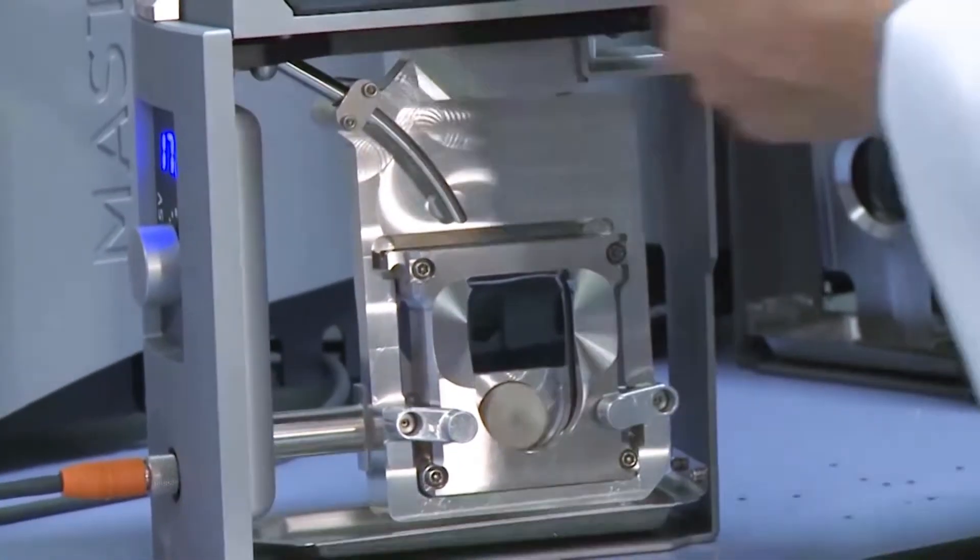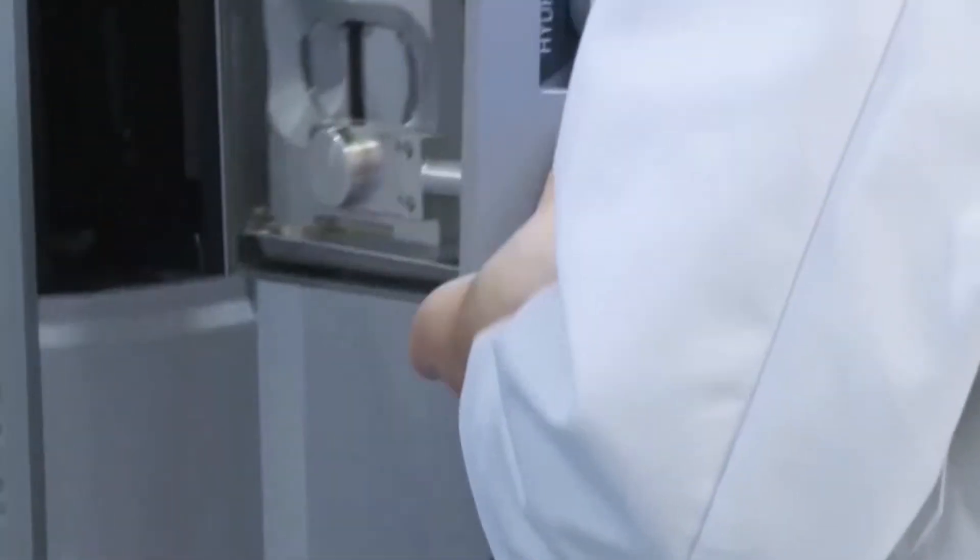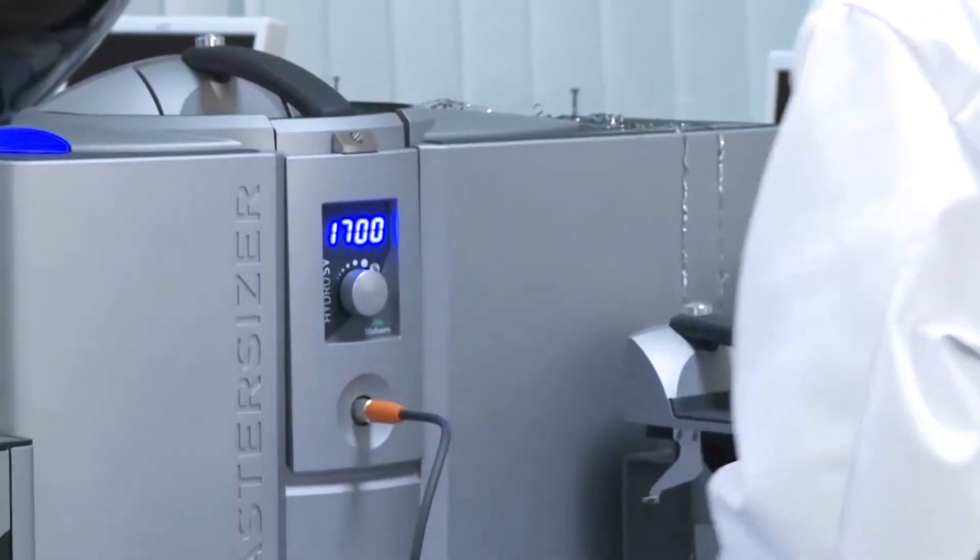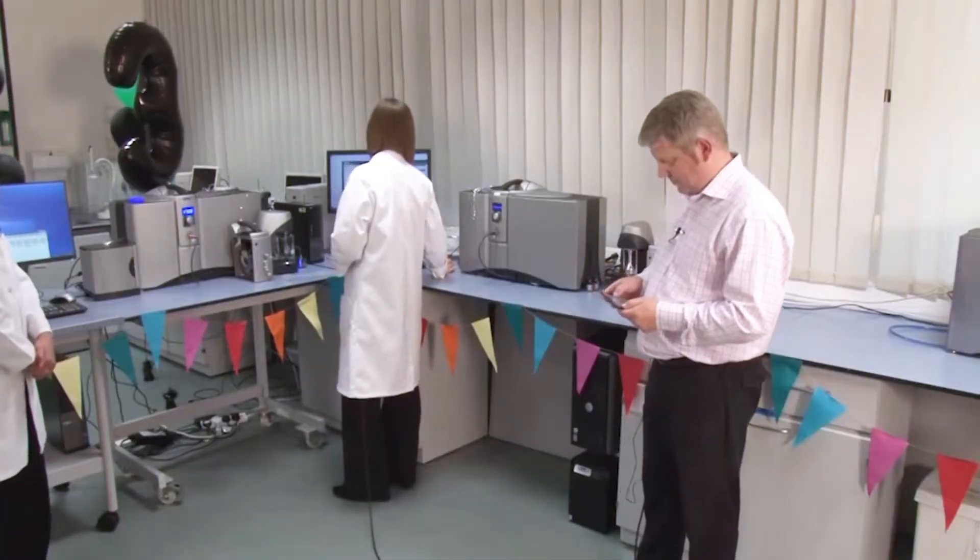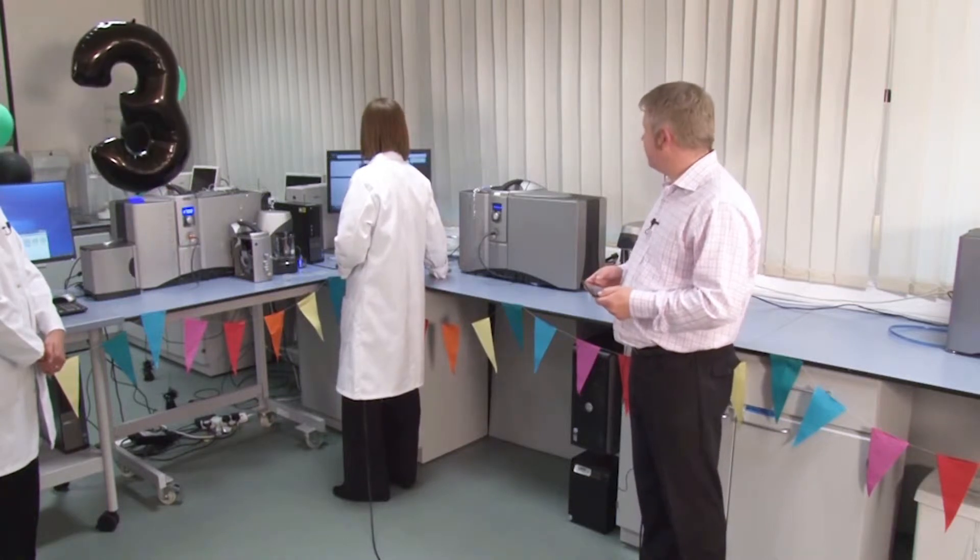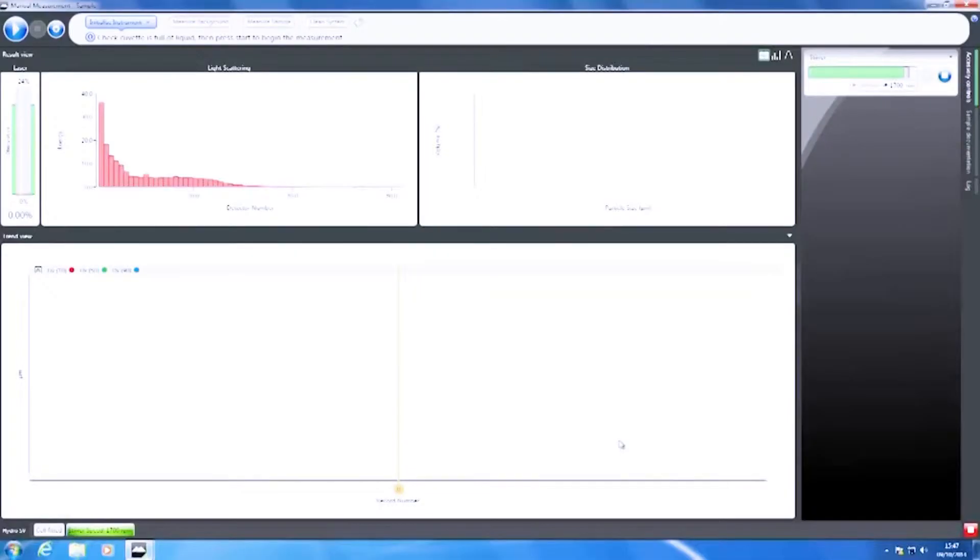There we go. So, what I'm going to do is just slot this into the measurement cell. There we go. And I'll start up a measurement on the Mastersizer 3000. OK. We'll start up the manual measurement, and like any diffraction measurement, what we'll do first is we'll do an alignment and a background, and then I'll drop in some sample, get it to the right kind of obscuration, and then start measuring.